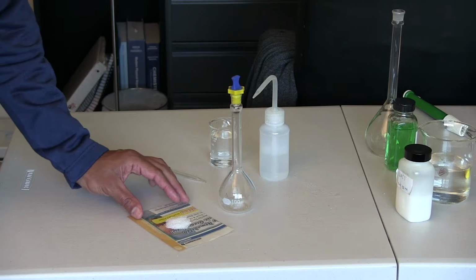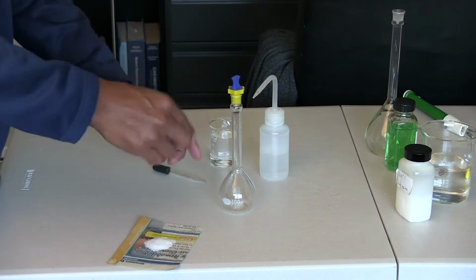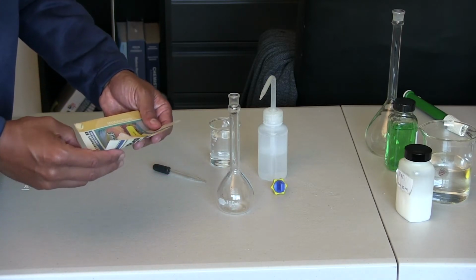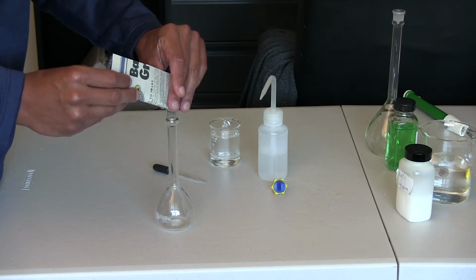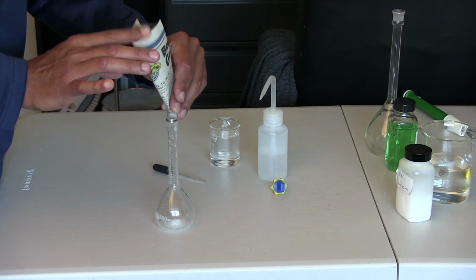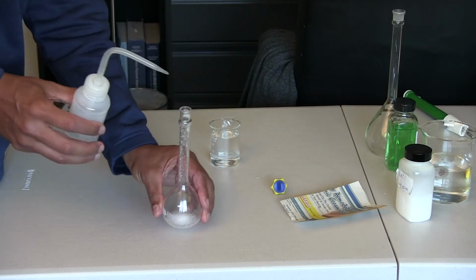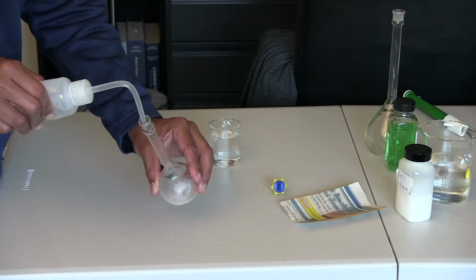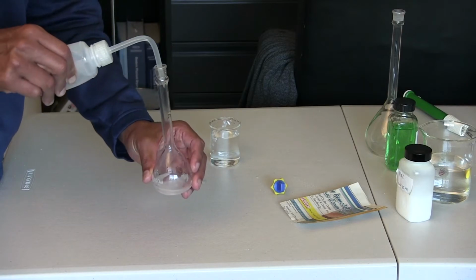So I went ahead and got some salt here. What I'm going to do is fold the weighing paper and place the salt inside the volumetric flask. So I'm just going to fold the weighing paper like this, and I'm going to place it in here. Now I'm going to take some distilled water and add some to make sure that I dissolve all of the salt that I added. Now, I'm not going to fill the flask with distilled water yet, not yet. First, we want to make sure that all the salt dissolves before we do that.